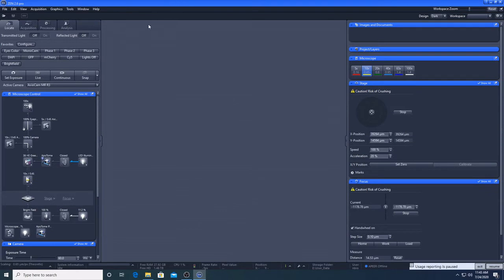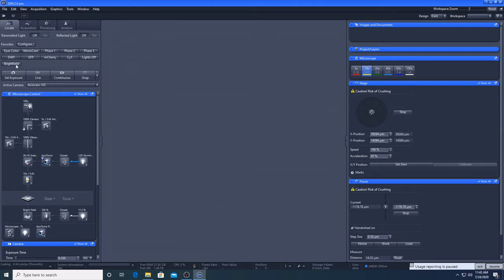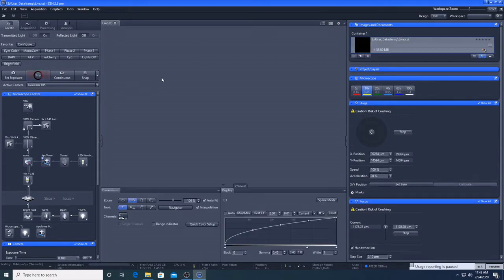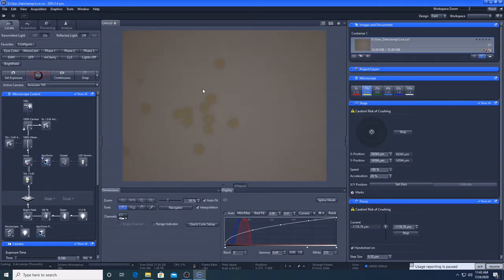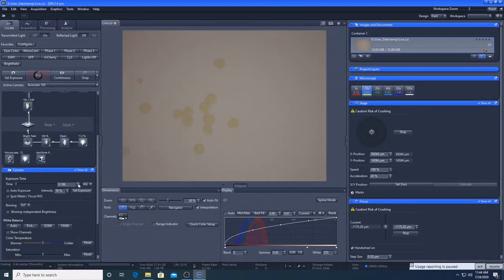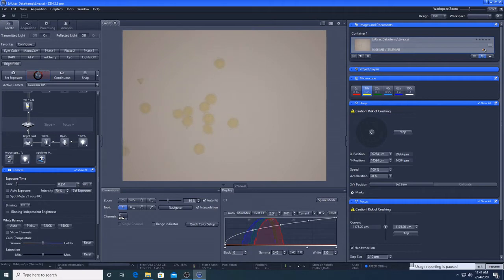To view the sample in bright field, I will switch to the colour camera, press bright field and go live. The image is a bit dim but I don't need to make it perfect at this stage. You can see that the histogram now has three lines because the colour camera is producing an RGB image.